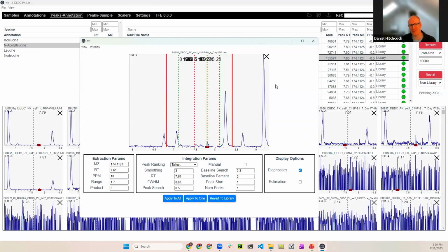But my point is, anyways, switching metabolites does take a little bit of time, and committing to these things like changing it. But in real time, you can make the adjustments, and then whenever you need to switch metabolites, you can stretch or get coffee or something. And if you need to extract, then you can do that also. So maybe I'll get back to the presentation.